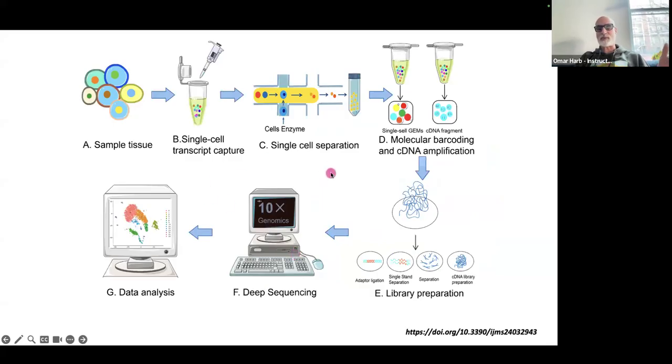I think most of you are familiar with this, but I think the key aspect of single cell omics is the ability to use these microfluidics to basically put a single cell into a single droplet. And in addition to having a single cell per droplet, you also are able to integrate all the enzymes and everything that you need to do your chemical reaction.